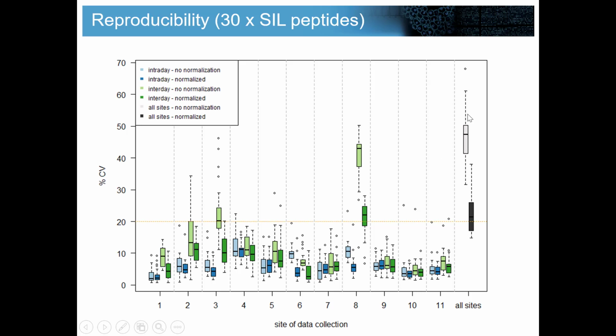So this is all completely label-free, and just with some normalization applied. But what this gray box is depicting here is the CV if you just take all the label-free data, and it's roughly 40–50%, which is not great.